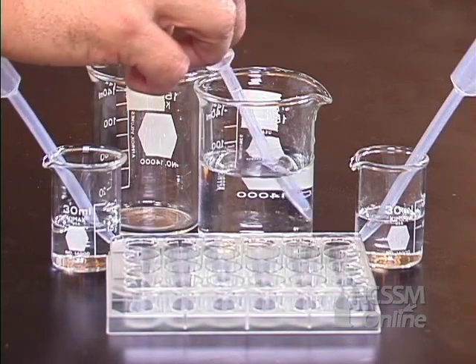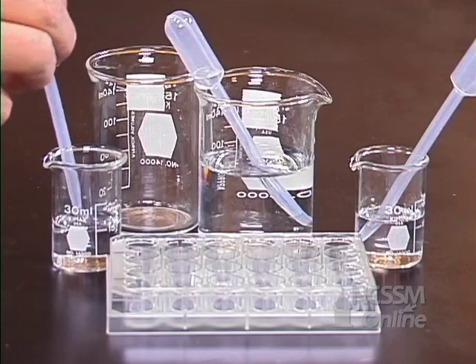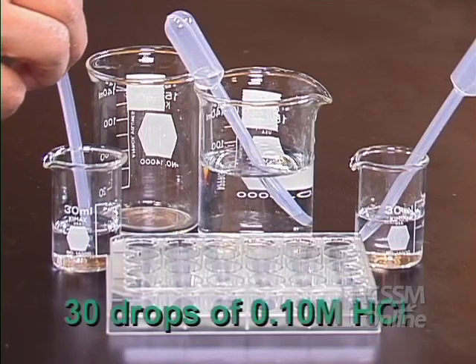In well 1 of the first row, place 30 drops of 0.1 molar HCl.